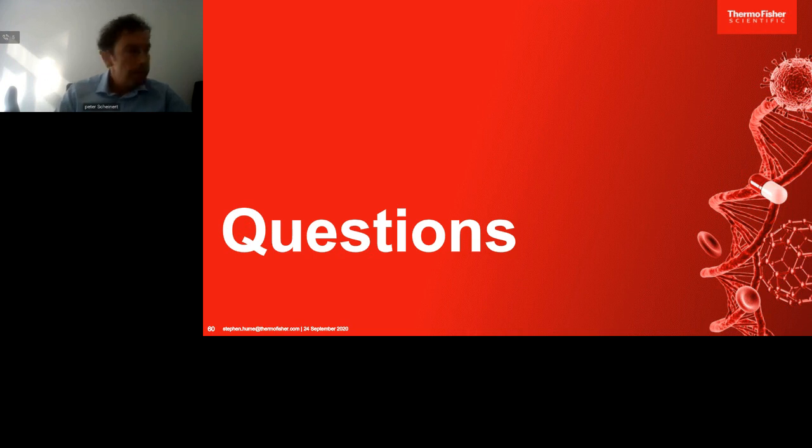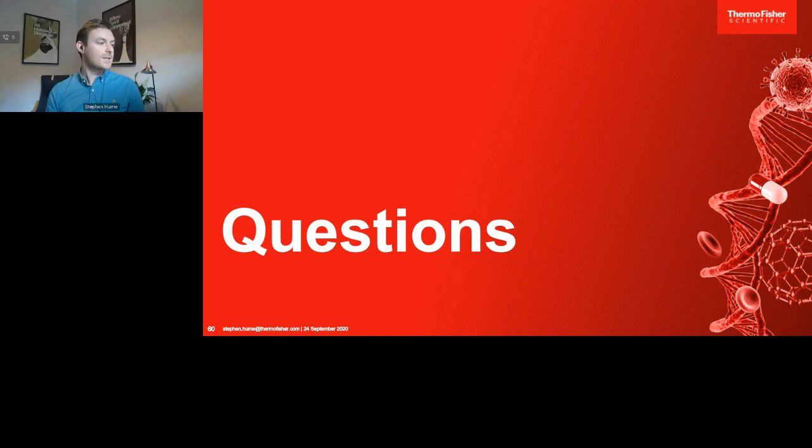Okay, Anna, we've got a question here for yourself. Is the breakthrough dependent on the volume of load or amount of product loaded? Does your mass balance close?